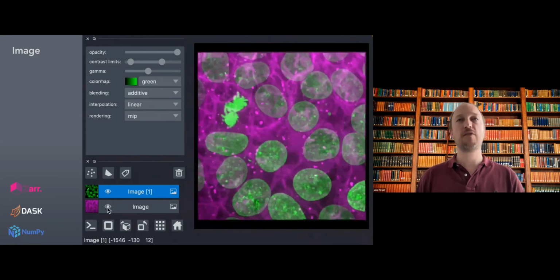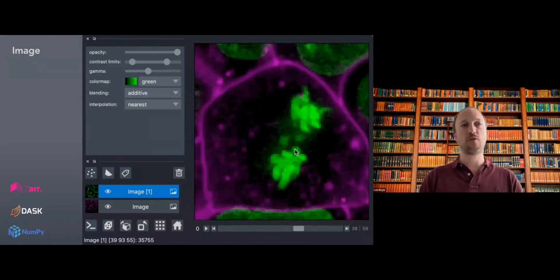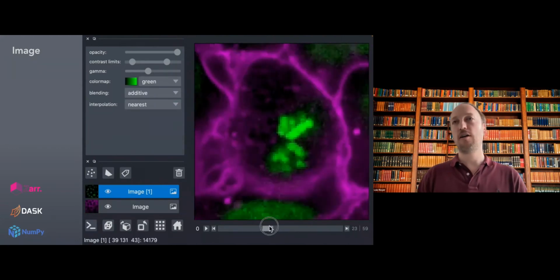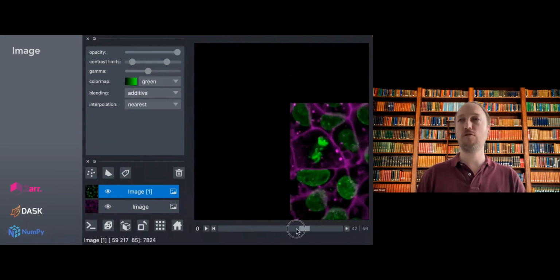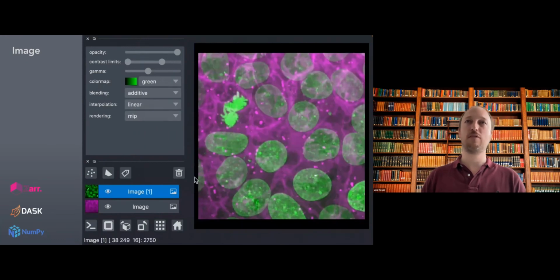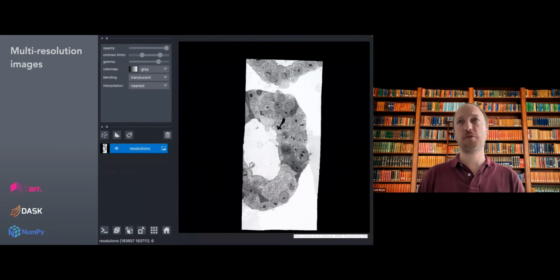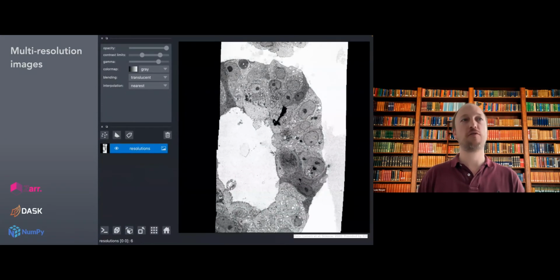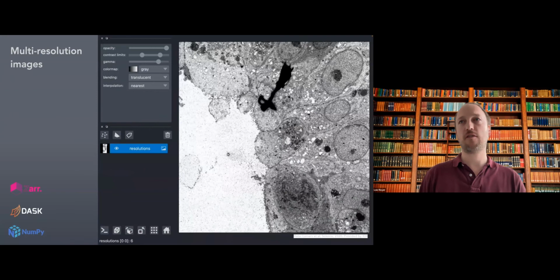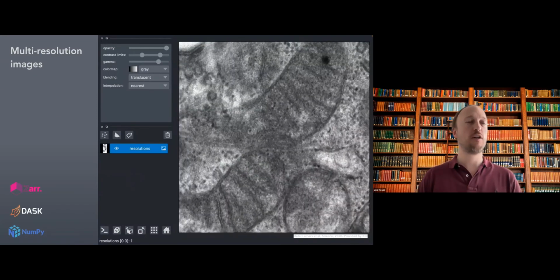I think recently we have new features that let you combine and split layers on the basis of color. In fact, there are so many new features at every release that I don't know them all right now. That tells you something about how fast the project is going. And then another example shows the interfacing of Napari with the Python scientific infrastructure.